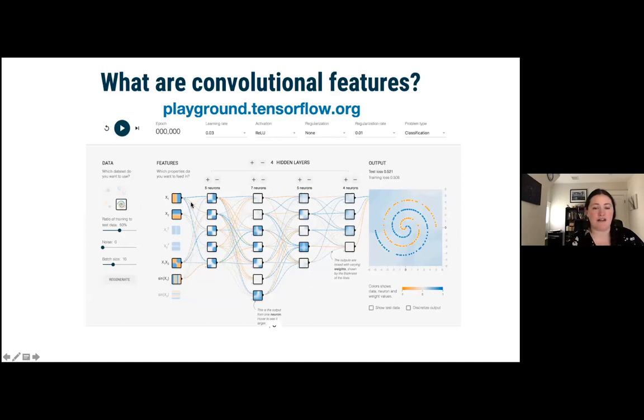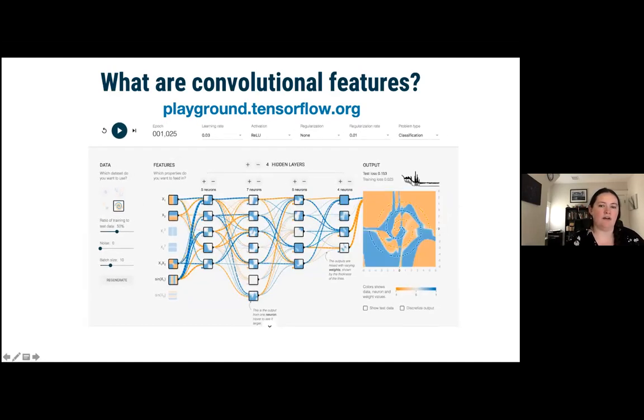in the context of biological images, just a bunch of image filters that are passed over an individual image. And depending on how much each filter is fed into the next one, you can create essentially different abilities to predict. So this is a before training neural network, and this is an after training neural network. And you can see here the lines that connect each filter in each layer to the filters in the next layer are now different widths. We call these filters, and we call these weights.